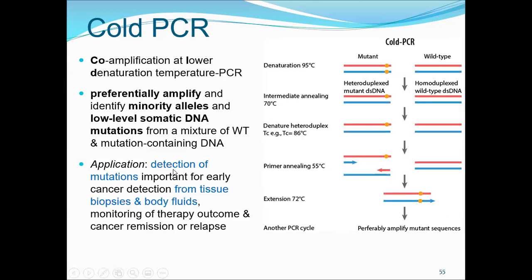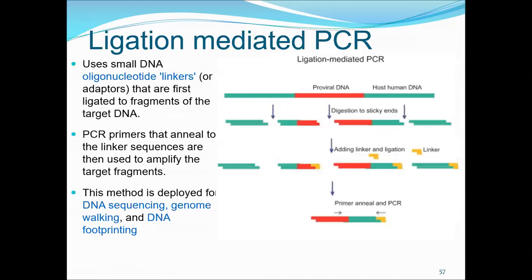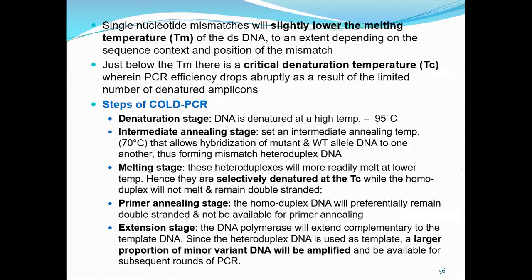So this is used for the detection of mutants in cancer from tissues and body fluids. Also monitoring the outcome of the therapies and cancer remission or relapse. So this was the protocol which I have told you.